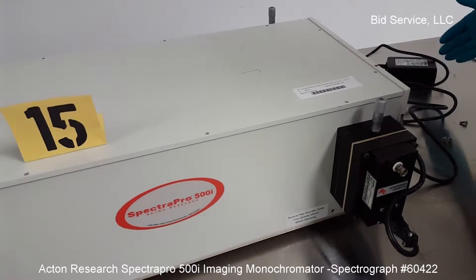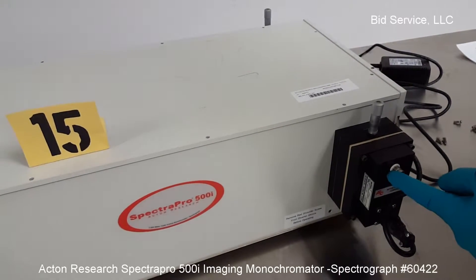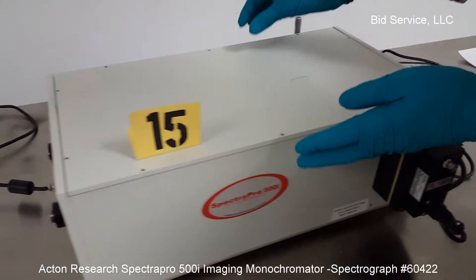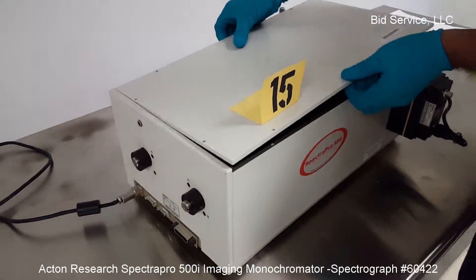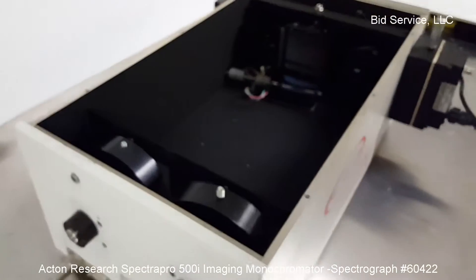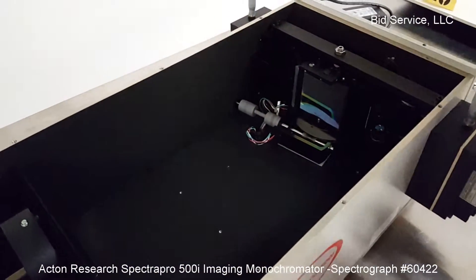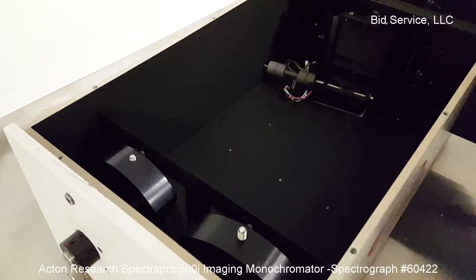Once the pre-amplifier is powered up, the output signal can be monitored here. I'm going to show the inside of the Spectrograph System — these are the two mirrors and the triple grating.